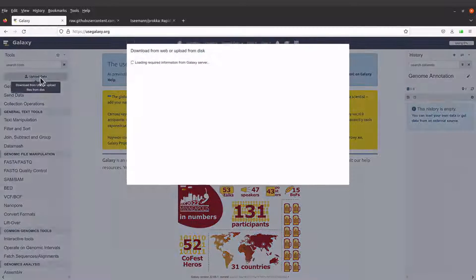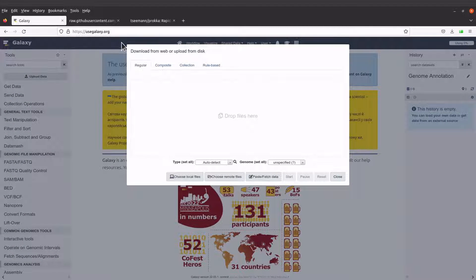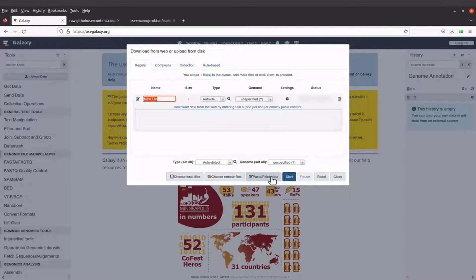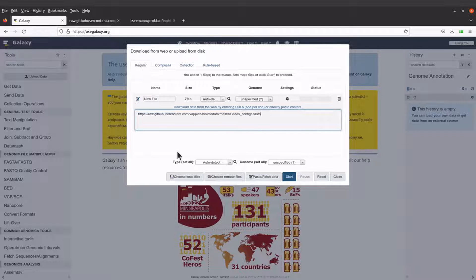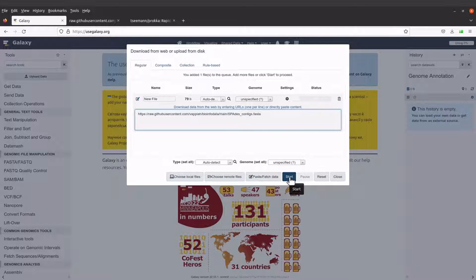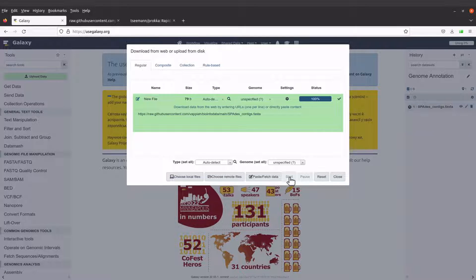On the left side you will see the 'Upload Data' button — click it. Make sure you have selected 'Regular' and then come to 'Paste/Fetch Data' and click it. When you are here, don't change anything — come to the entry box and paste the link that you copied. The reason I don't want us to modify this is that we want to maintain the file name we saw on GitHub. Click 'Start' and Galaxy will fetch this data for us.